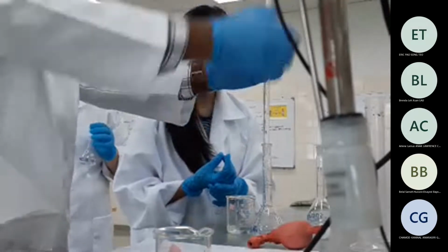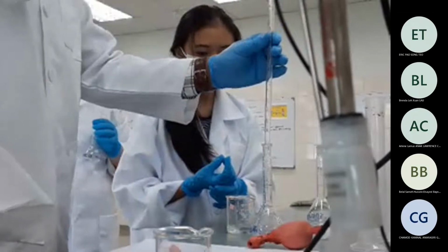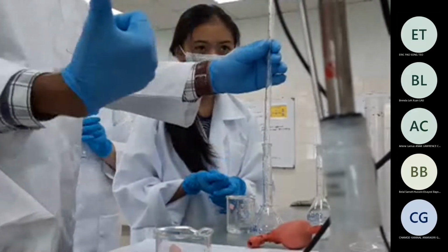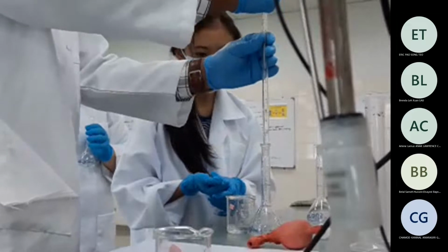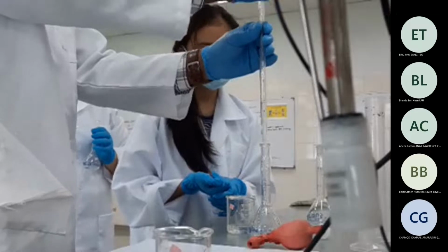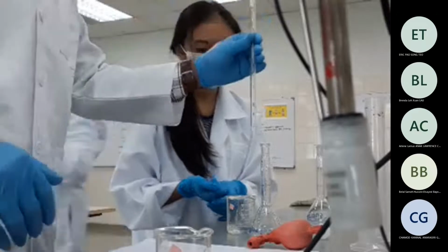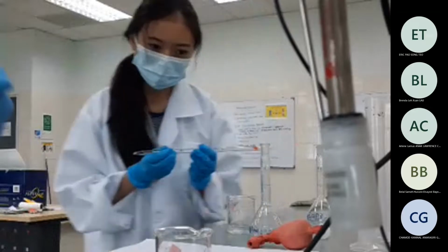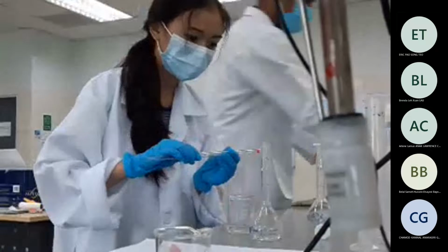So the meniscus, we take it, and we do not need to force it. Do not pump it out, or blow it, or shake it too much. Just take your finger, put it here, and gently press it. It will come, whatever is supposed to come. So it is considered that it is 10 milliliter dispensed there. I think I should wash it a bit. HCl.